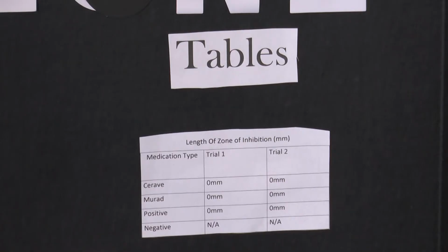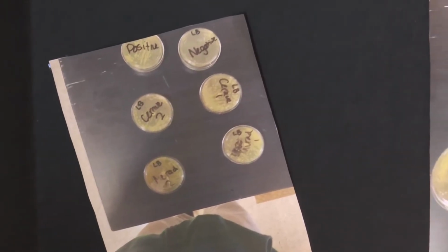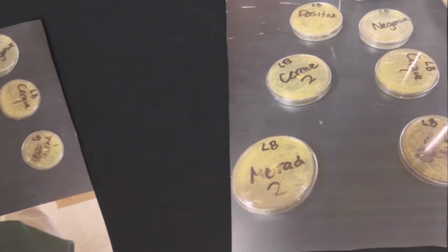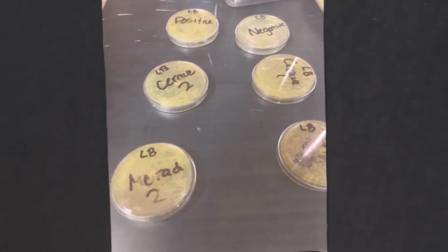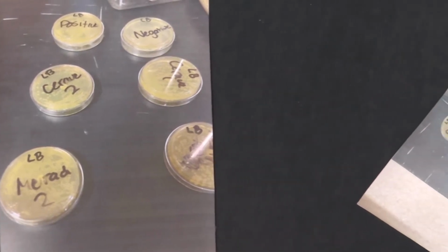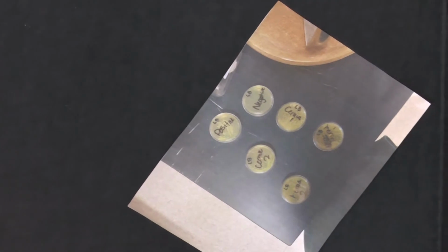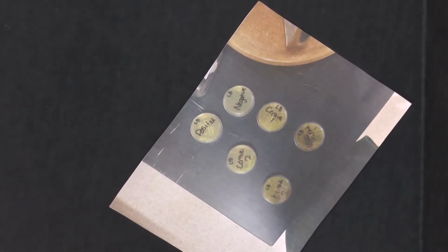I placed the disc on top of the E. coli, and I put it in incubation for about 2 days to allow the E. coli to grow and proliferate. And I went to see how much it stopped the growth of the bacteria. And basically, my method came out to be that it didn't stop any of the growth.